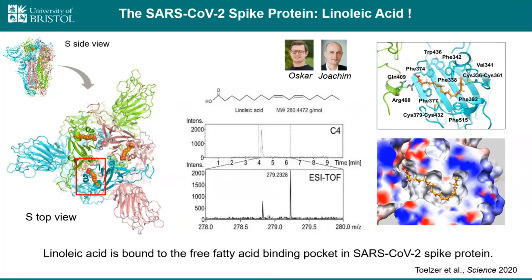So in the end, we decided that we should look into the cells. Together with Paul Verkade and Lorna Hodgson in Bristol, we performed CLEM experiments. Here is the control experiment where we have Caco-2 epithelial cells which express ACE2 and which we infected with this GFP expressing SARS-CoV-2 virus. Because we wanted to look only at infected cells, which apparently looked healthier, we decided to treat the cells only 1 hour after the infection with 50 micromolar linoleic acid.